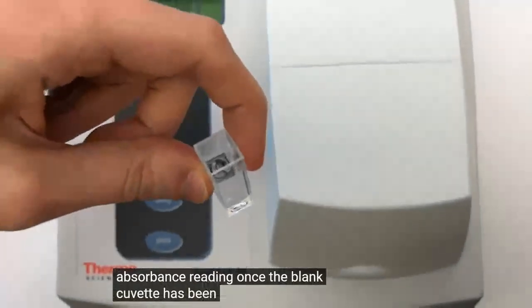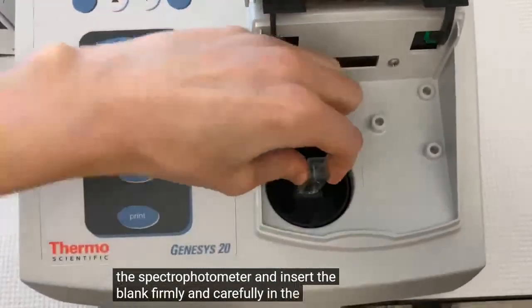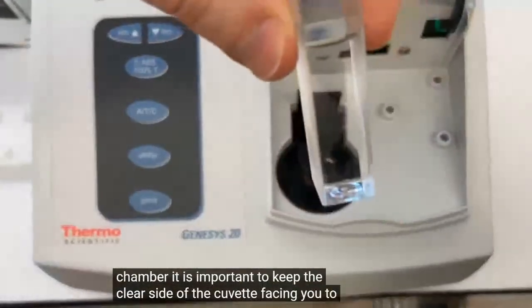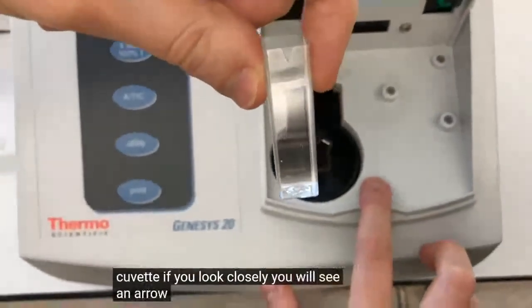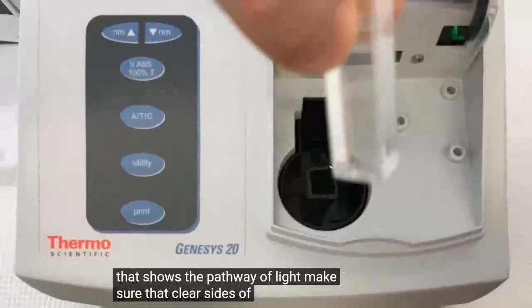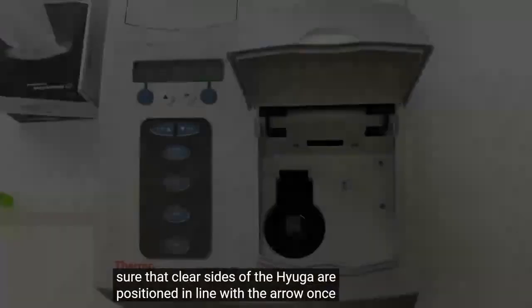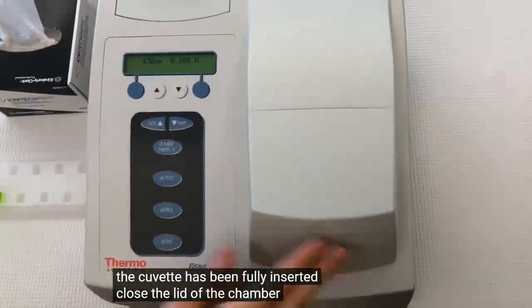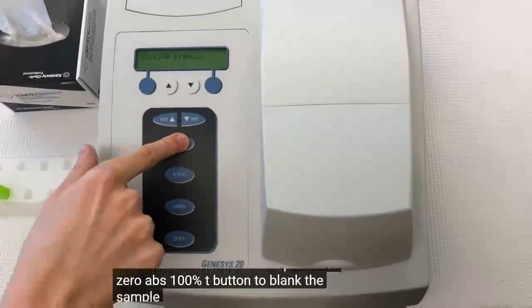Once the blank cuvette has been cleaned, open the lid of the spectrophotometer and insert the blank firmly and carefully in the sample chamber. It is important to keep the clear side of the cuvette facing you to allow the light beam to pass through the cuvette. If you look closely, you will see an arrow beside the slot for the cuvette that shows the pathway of light. Make sure the clear sides of the cuvette are positioned in line with the arrow. Once the cuvette has been fully inserted, close the lid of the chamber. Press the 0 ABS 100% T button to blank the sample.